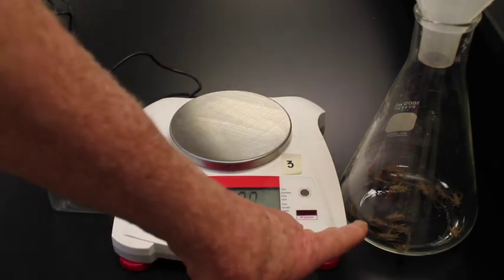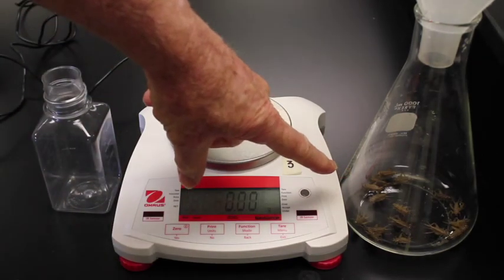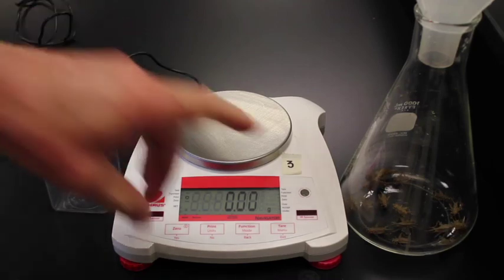Now if you look at the crickets, they're all different sizes. And so 5 crickets then would have a different mass. Typically in science then you want to replicate your experiments. And so when you replicate your experiments, in order to analyze your data, you need to have each replicate on the same scale. So we could do 5 crickets as our scale and divide everything by 5 and go per cricket. But since 5 crickets weigh different, have a different mass, it would be more appropriate then to actually mass the crickets, divide by the mass of the crickets and go per gram, which would be much more accurate in moving on. So what I want to do is get the mass of the crickets.